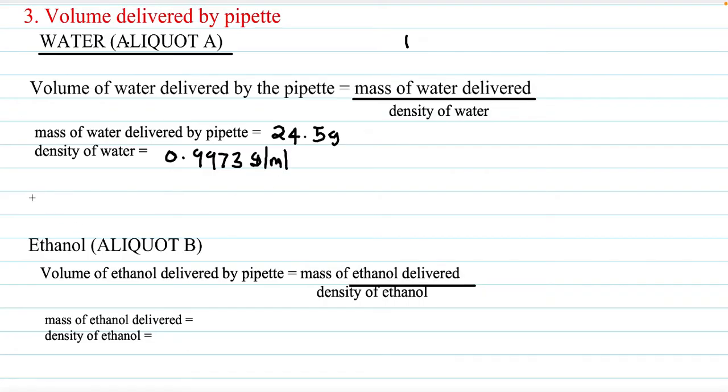Alright, so we now say the volume of water delivered by the pipette.